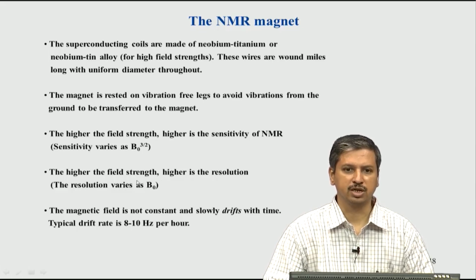The other thing which we will see later along the course is that as you increase B0, one more important gain you get is resolution.